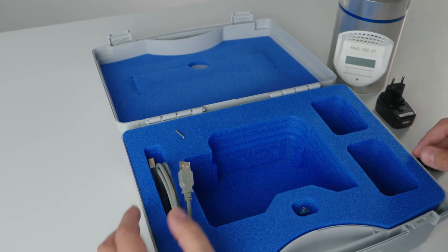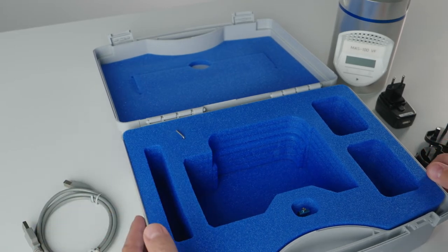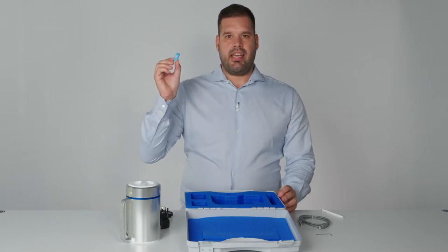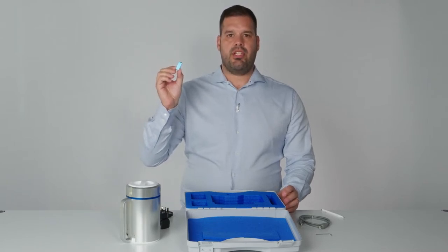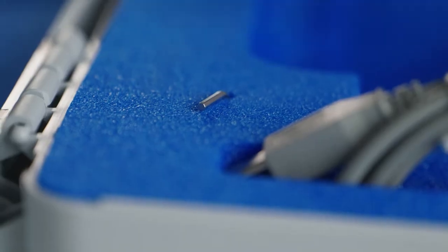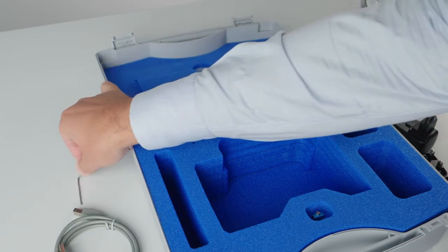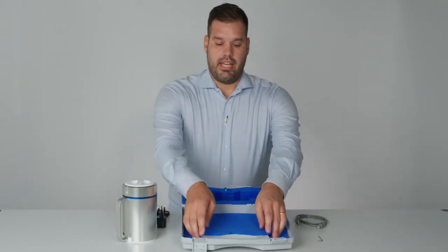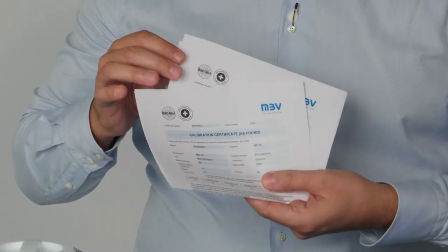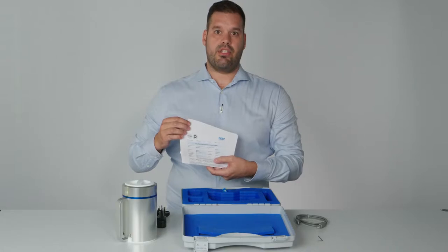The USB cable is needed for charging the instrument and also for configuration and data transfer. This memory stick is very important — it contains all safety information, manuals and declaration of conformity. This Allen key is used to adjust the Petri dish holder to the specific size of your plate. Here, in the lid of the case, you will find the calibration certificate of your air sampler and the certificate of the digital flowmeter that was used for calibration.